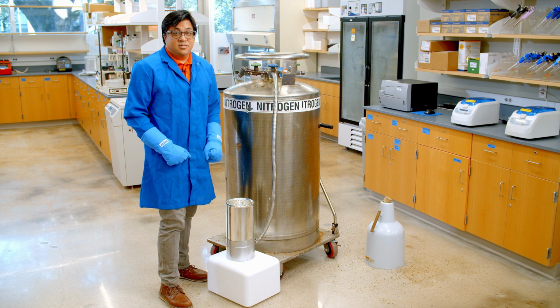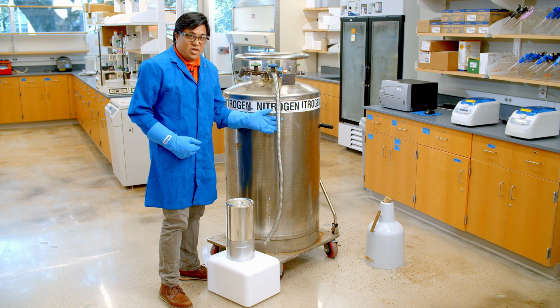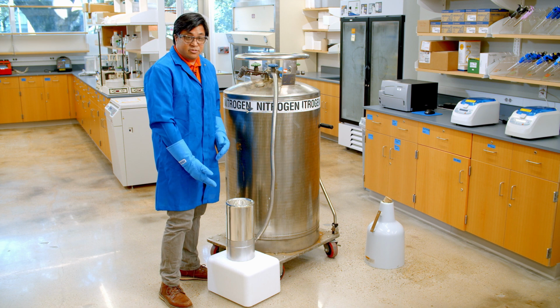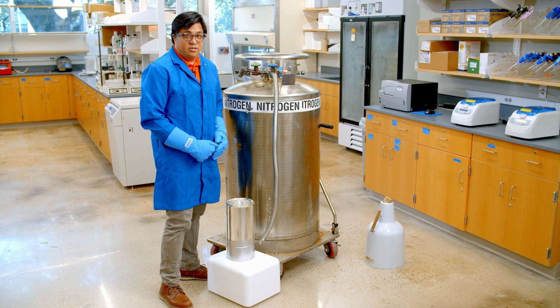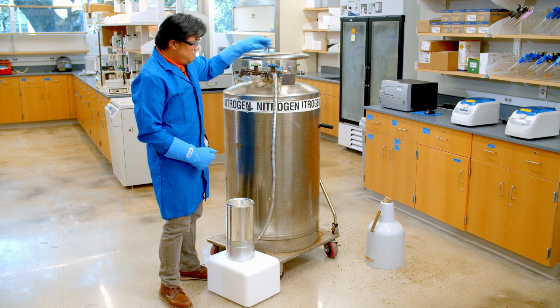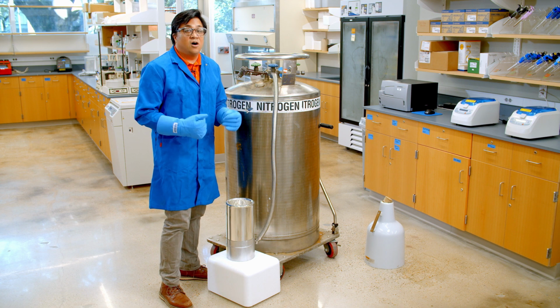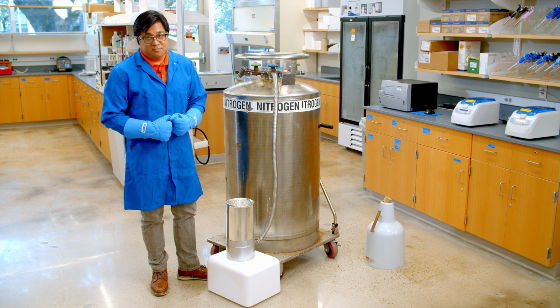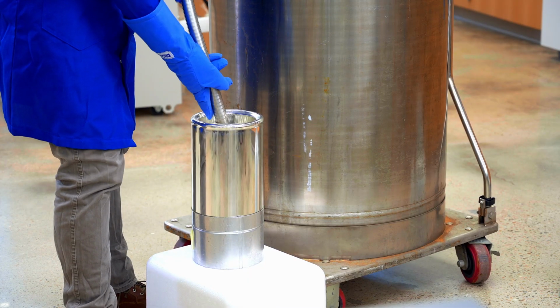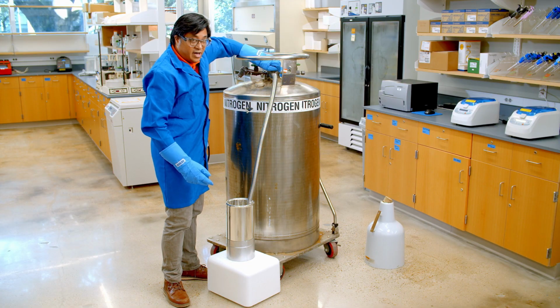So when you're ready to dispense liquid nitrogen, here are a couple key points to keep in mind. Always use a vacuum jacketed transfer hose and a container that's appropriate for cryogenic temperatures. In this case, a vacuum jacketed dewar. Never operate the valve or the transfer hose without wearing your thermally insulated gloves, and always work in a well-ventilated space. The first thing you want to do is have the hose placed inside of your container and slowly open the valve.